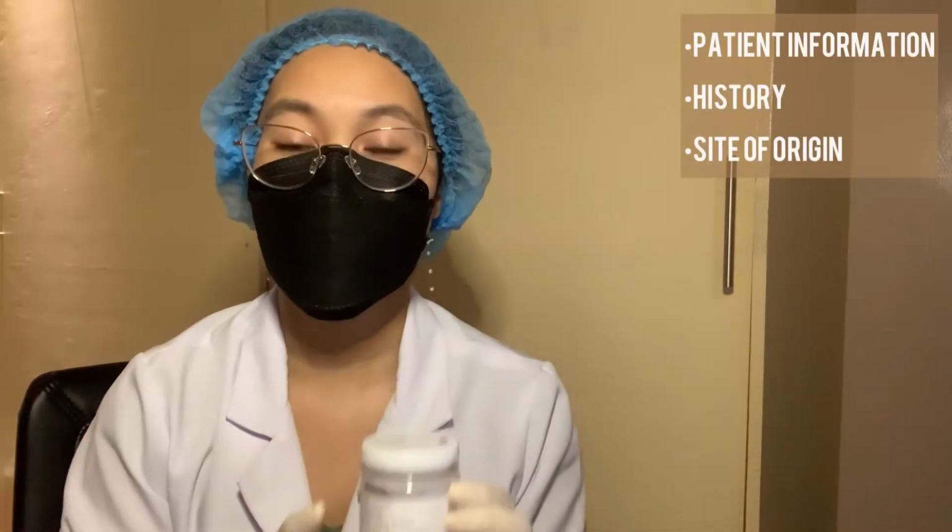Tissue specimens received at the surgical pathology lab are accompanied by a request form containing patient information and history, as well as a description of the site of origin. The first step is to make sure that the specimen is in good condition and securely sealed, and we also have to make sure that it was prefixed in formalin.